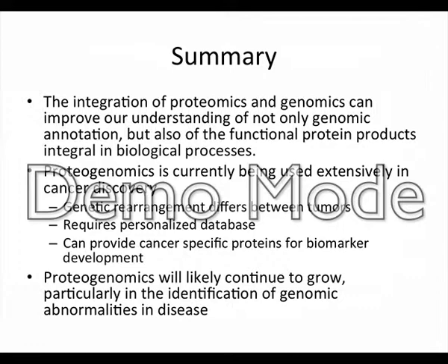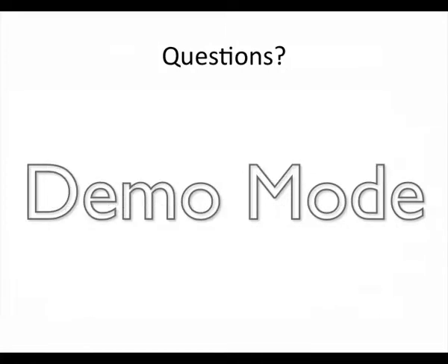And it's likely that as sequencing continues to grow, proteogenomics will also continue to grow, particularly in identifying genomic abnormalities in disease. Does anybody have any questions about this? I think it's all very exciting, personally.